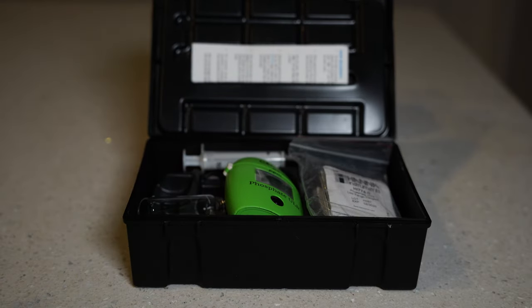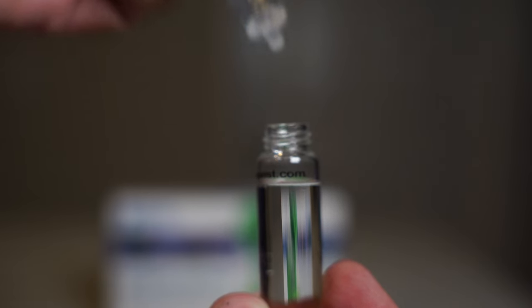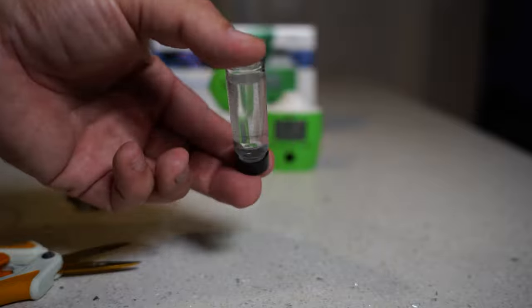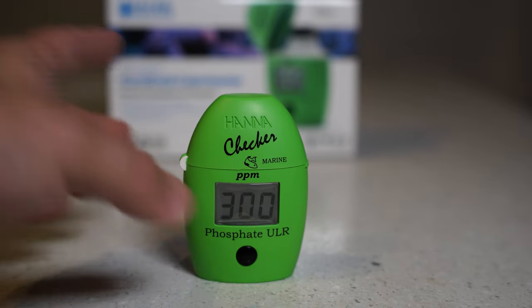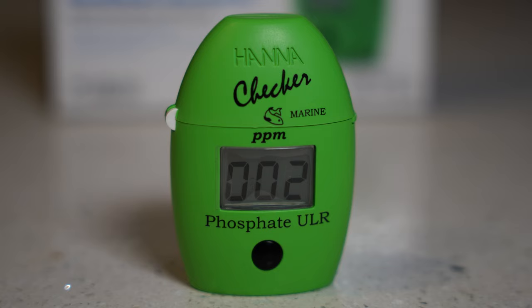The Hanna phosphate checker is similar to the nitrate, but there are some differences. Go ahead and push the button to turn it on. When you see C1, fill up the vial to the 10 milliliter level and put that into the checker and push the button again. When you see C2, open up the packet and pour in the contents. For two minutes you're gonna shake, but not aggressively like the nitrate. Then put it in the checker and hold down the button — it's gonna do a three-minute countdown and then you're done. For phosphates, anything under 0.1 ppm is ideal for a mixed reef tank. Higher levels can hinder coral growth and lead to unwanted nuisance algae. My phosphates are showing 0.06 ppm, which is under 0.1 ppm and above zero.